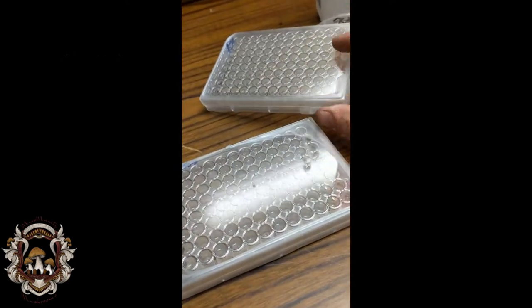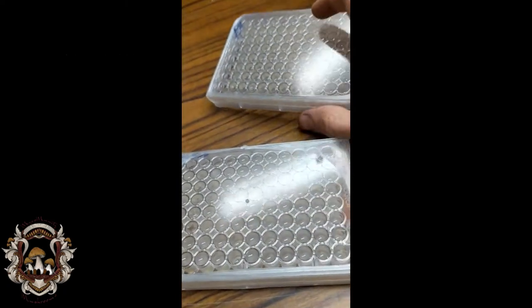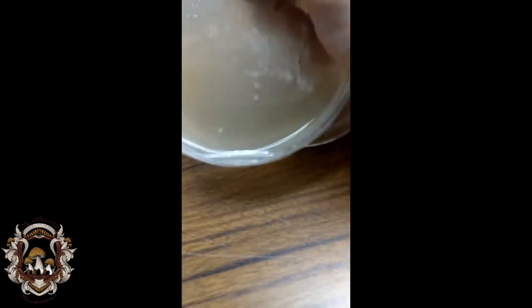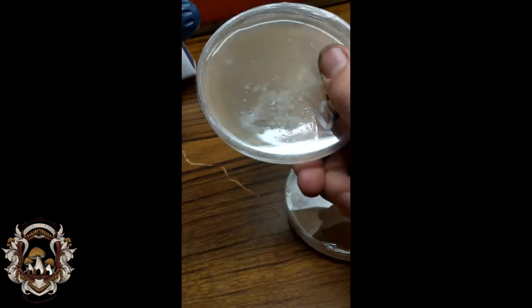This is not a control plate, nor is this. I mentioned it in the other video, and I was gonna toss them. Just figured, whatever, but then I went back to the print, and, as you can see, clearly we have germination.